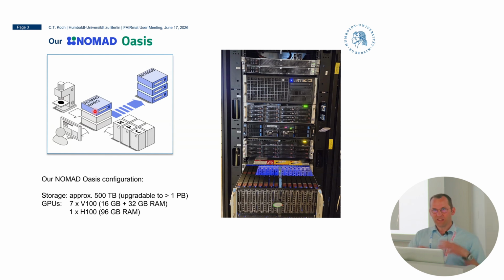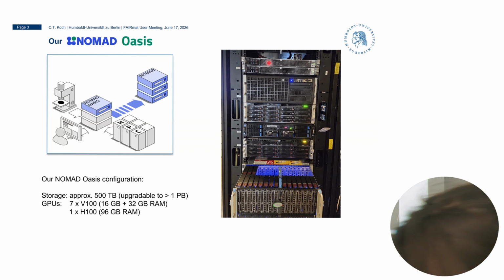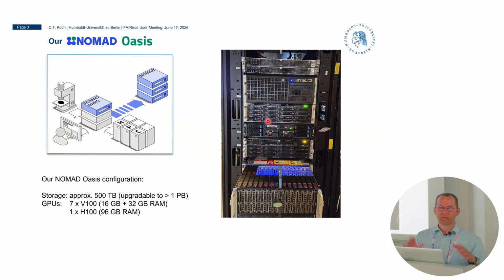Not all the data. We're in the process of automating the indexing so that it becomes available immediately, but that's not available for all instruments. It's only available for one instrument so far. And then we have, in the same rack, some, I would call it high performance computing, at least in our limited view of what that means.